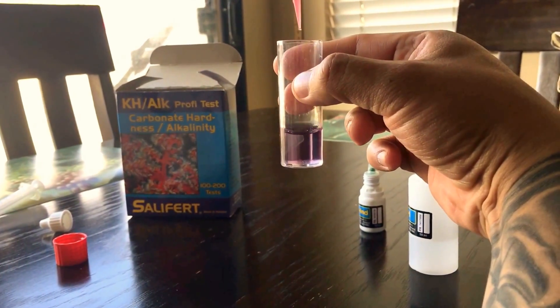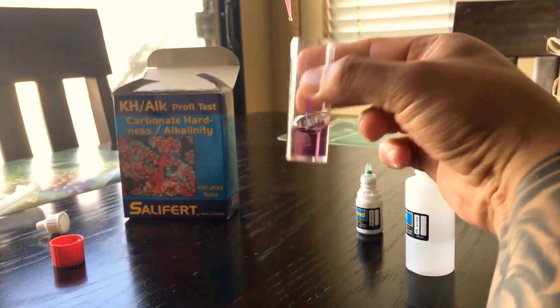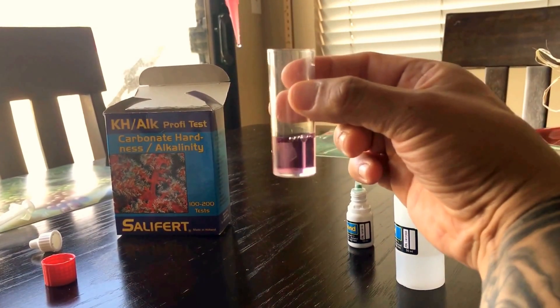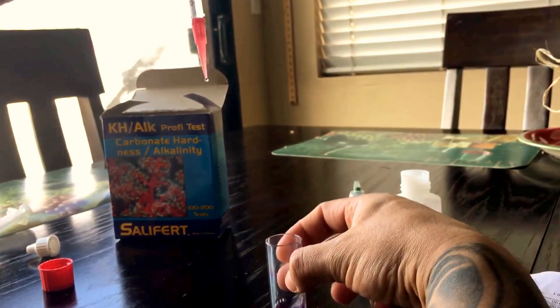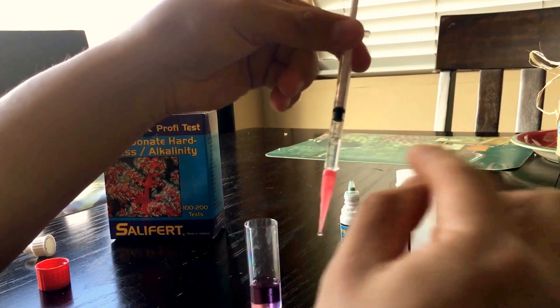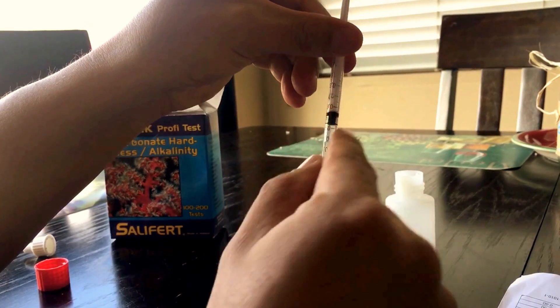You're gonna wait for the color to change to pink. Okay, there it is. I always like to add one more drop to get that really, really pink color, so I can really be sure. Now you're gonna go to the measurement paper.